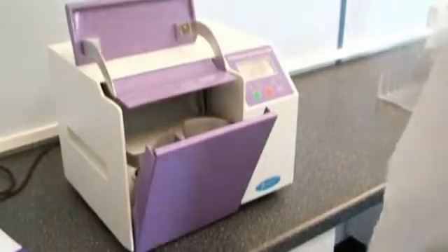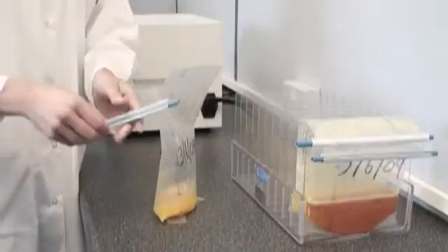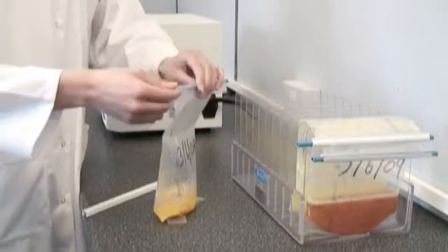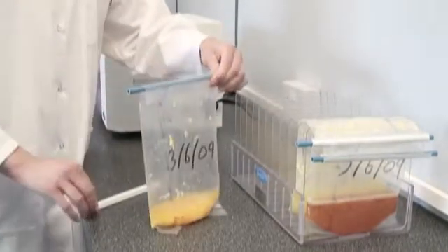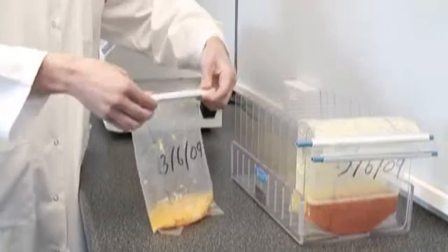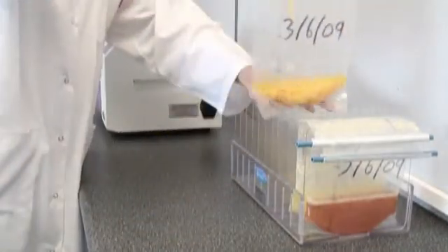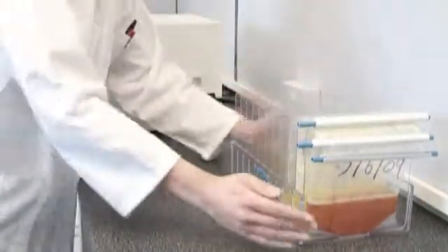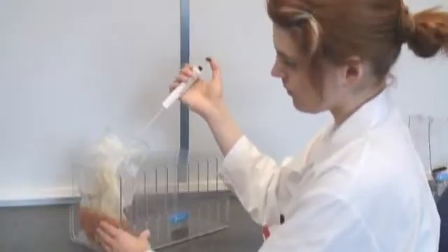Seward has created a wide range of Stomacher bags and accessories to aid sample preparation, including bag clips, bag racks for storage and incubation of samples. Stomacher strainer bags contain a robust strainer element, making it easier to pipette certain samples.